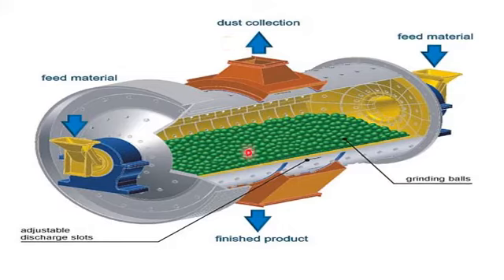Ball milling is known as a chemical synthesis method, although this method usually does not involve a chemical reaction. Okay, it just crushes the material mechanically by impact. But in some cases chemicals or a solvent may be used in order to convert a bulk material into nanomaterials. So ball milling is one of the central techniques of mechanochemical synthesis, that is a chemical synthesis by action of mechanical force such as by grinding, stretching or shearing.